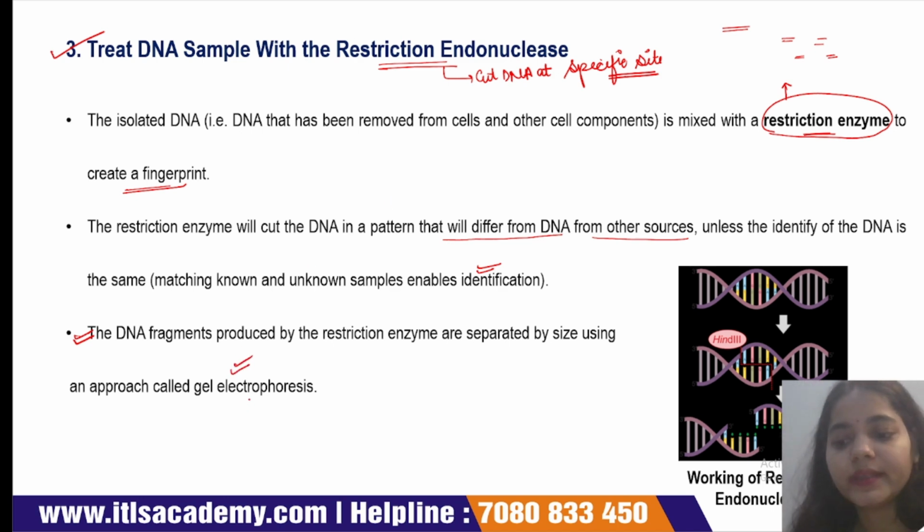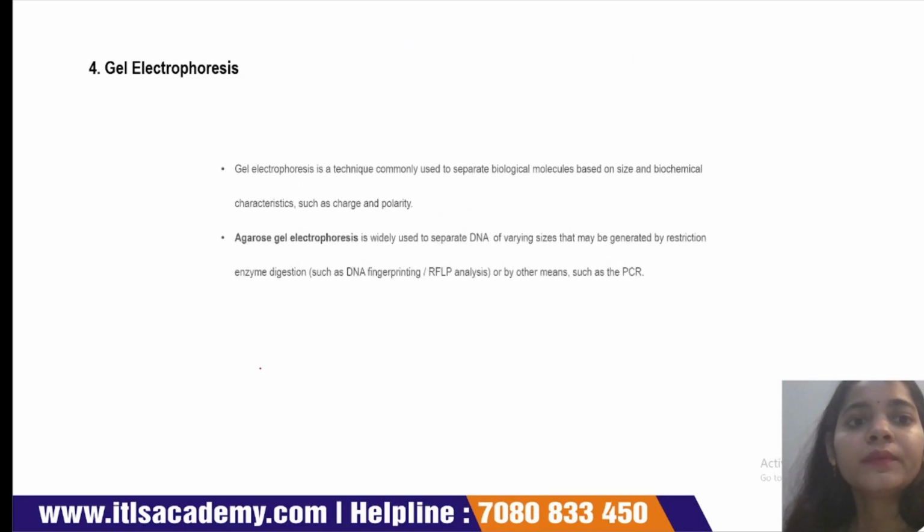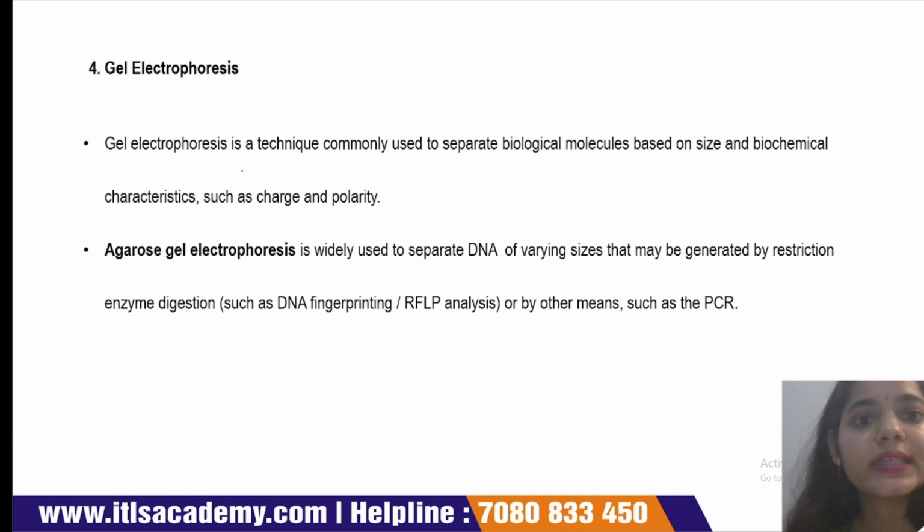Now we understand the process of gel electrophoresis. Gel electrophoresis is a technique commonly used to separate biological molecules based on chemical characteristics such as charge and polarity.